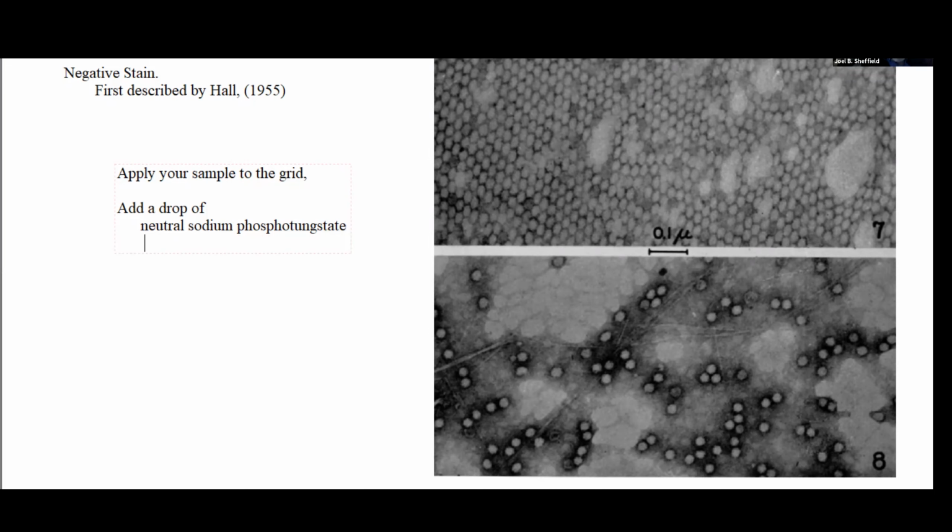Other solutions that will do something similar are uranyl acetate, and instead of acetate, there's a molybdate. There's several of these solutions that can be used.